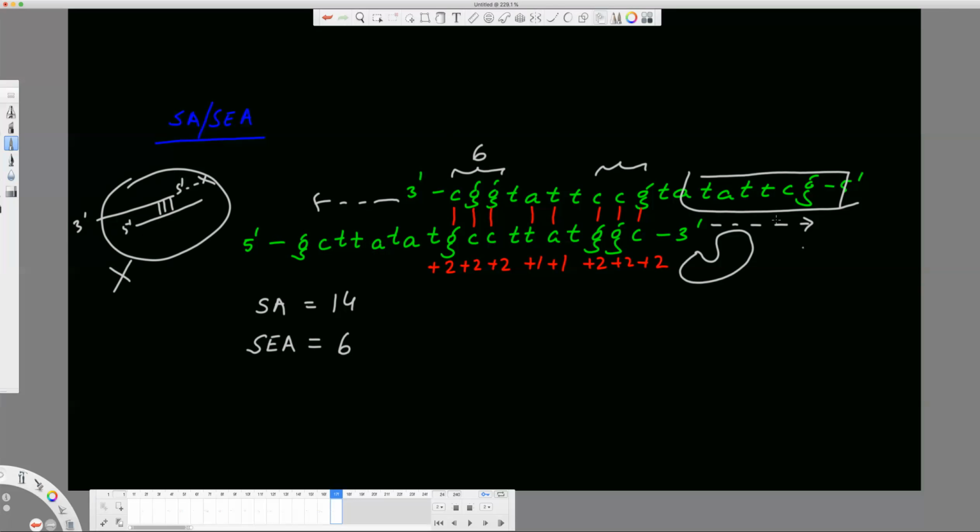Now, which means that the primer is amplifying itself. So they make something called dimers. This is called primer dimer, which is bad. They will keep on amplifying themselves, and you will see a thick band at the bottom of your gel. If you run the gel electrophoresis, you will see a very thick band at the bottom, which is the primer dimer. This is bad for you. It means your PCR was not optimal. Most of the resources were used in making primer dimer rather than amplifying your product of interest.